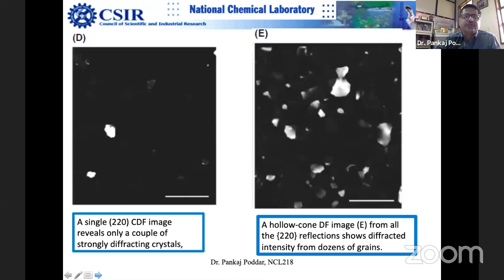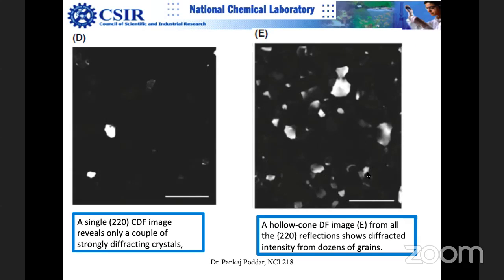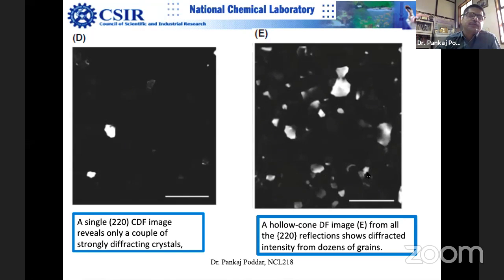People are synthesizing all kinds of chalcogenides and stuff like that. I don't know why they don't do it. Monica Galawat, you are studying these chalcogenides and nucleation growth. So this will be a very nice tool for you because you are looking at exactly the same problem. You can light up selectively those grains which are growing in a particular direction. Just first ask the operator to form the electron diffraction dot pattern, and out of that just select one family of spots, make the image.